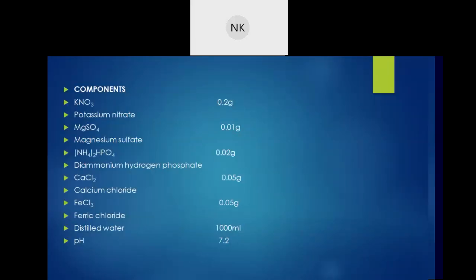So this is about media preparation. Along with this, I am also going to share videos of how we generally prepare this media, that is weighing, and after a particular period of incubation, how the bacteria, like on blood agar medium, are able to grow. The videos I am going to share in Google Classroom. You all can have a look. Thank you.